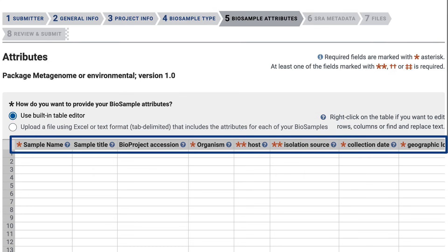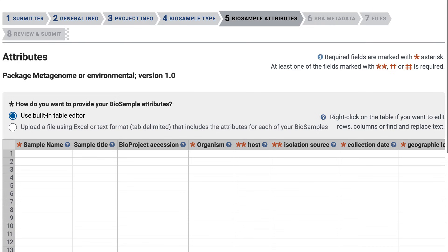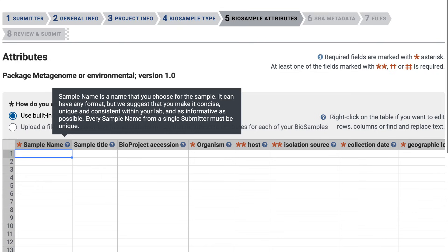The fields in this table come from the package that I selected on the previous page. For brevity, I'll fill in only the required fields, starting with sample name. I mentioned earlier that this was a submission of paired-end sequences. I have four samples, but I will enter only one sample name per pair of forward and reverse sequences. You will see how to enter the paired-end sequence files later in the SRA metadata step. So I'll fill in these four sample names — three for different days and a control: mouse stool day one, etc.